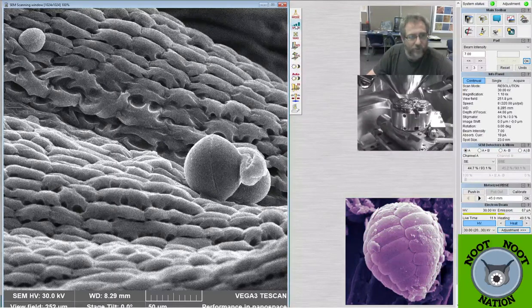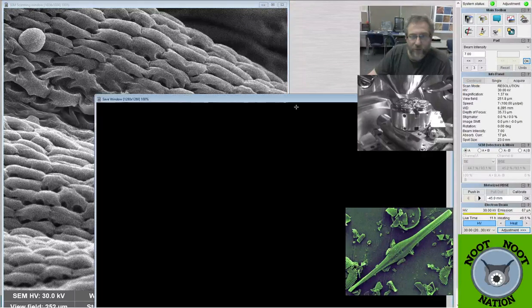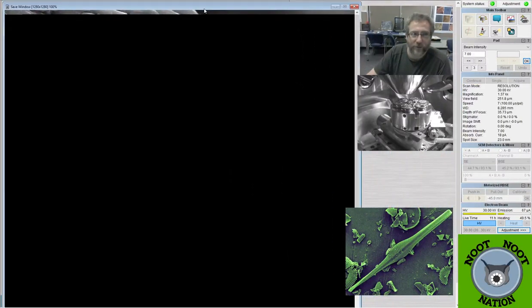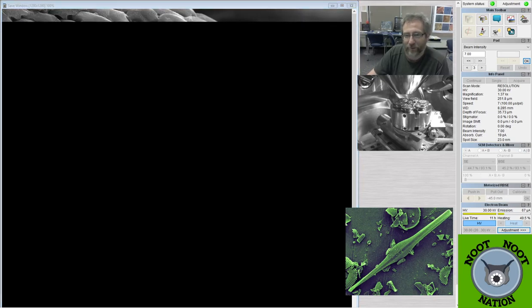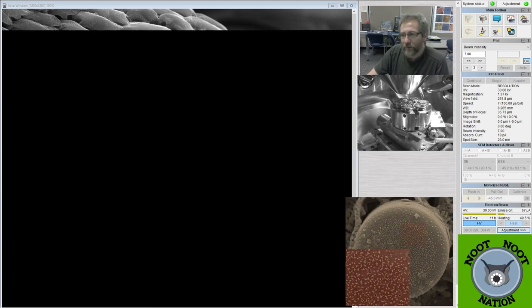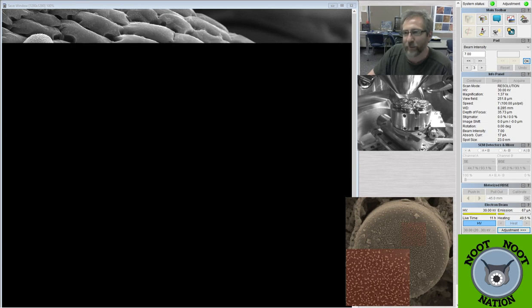So if I put this on speed 7, it'll improve the image quality quite a bit. And then I'll collect that image so I can interact with chat, because one of the things I can't do is run the SEM and see what people are saying at the same time. It's just a bit much. So thank you for the raid. Hopefully somebody gave Bald Engineer a shout out. Yeah, Pacific Plankton did. Thank you for that.